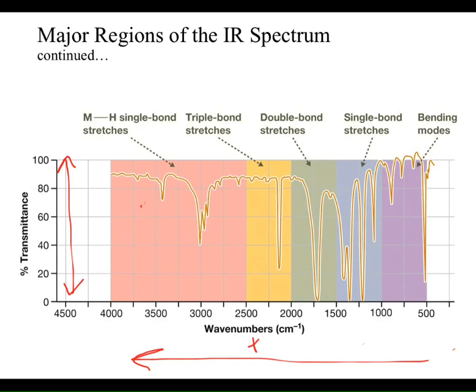So if we take a look at this green peak, that's pretty intense, and so is this one here. Okay? They're both pretty intense signals, but they do have a different structure or appearance about them. If we take a look at the green one, highlighted in red, of course I did that, let's go through and make it Christmassy. If we look at that base, this is kind of a broad peak. Okay? It's intense, but it spans kind of a large range. Admittedly, this is not a broad peak, but it's broader than, say, the red one. Because when we look at the red one, I can barely even draw arrows in there because the width of that peak is so tiny. So when we talk about IR, we get the intensity, strong, medium, and weak, and we also reference something about the breadth of the signal, which is usually broad or sharp.